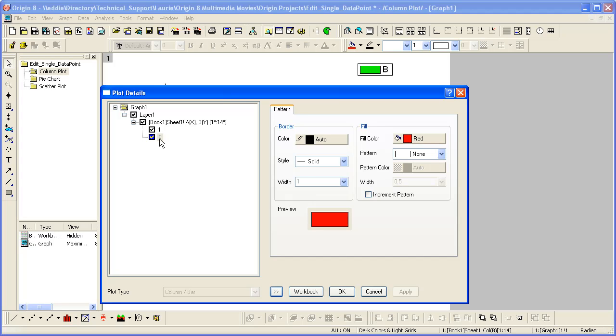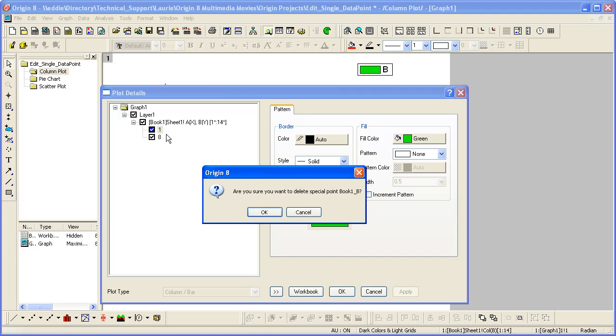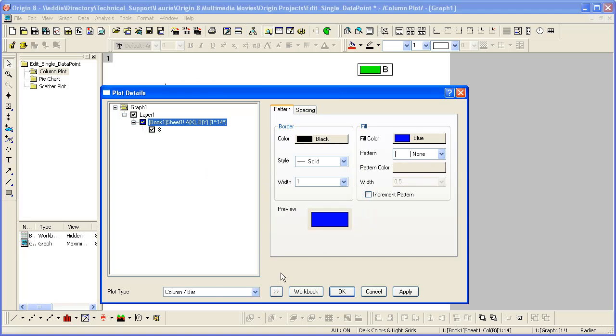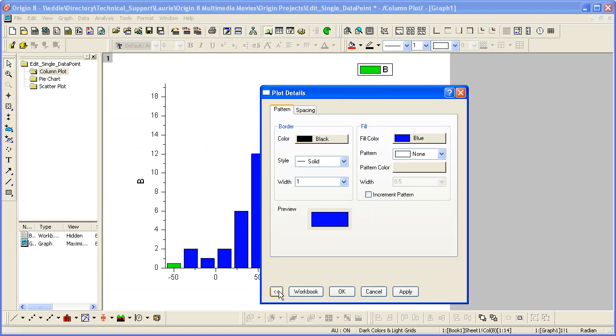If we wish to remove the special display properties of a single data point, you can right click on that point and say delete. The data point is not deleted. It just returns the display properties for that point to that of the entire data plot.